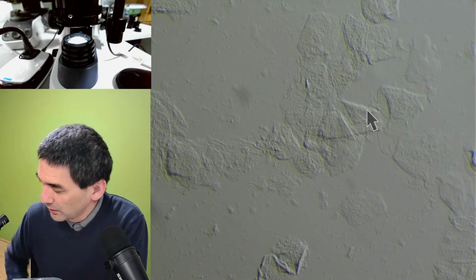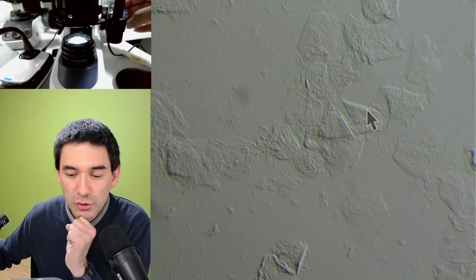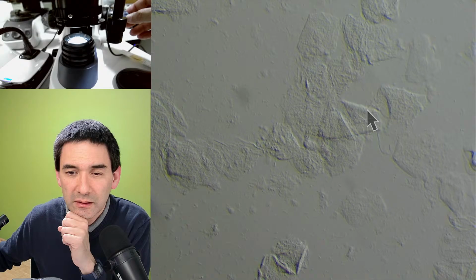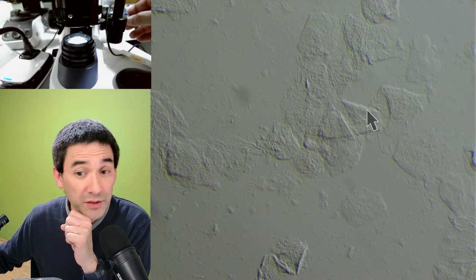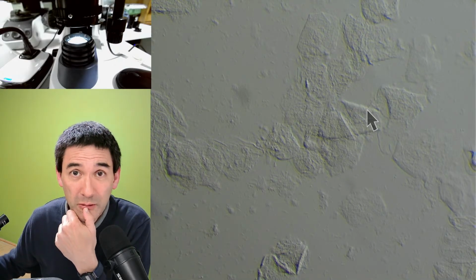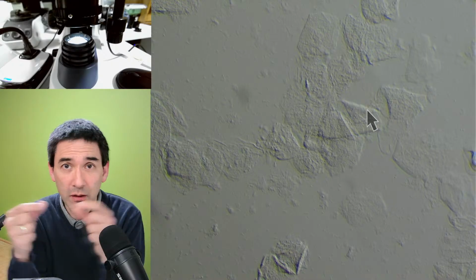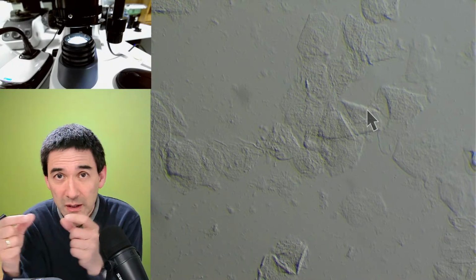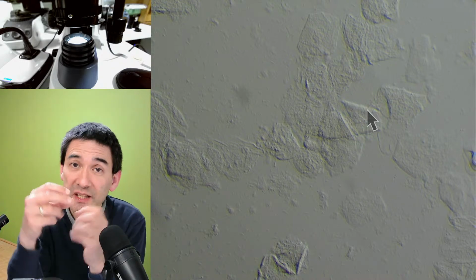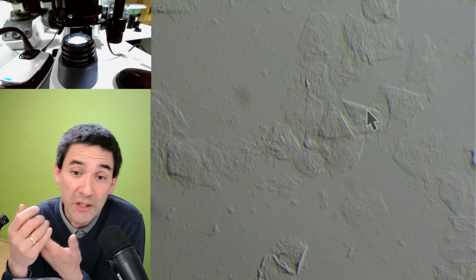Okay. So that is basically the cheek cells that I have. And a sliding filter, honestly, if you have a sliding filter, that should also work. I have also a microscope downstairs where you put a filter in and you can actually slide it horizontally. That also displaces it from the center, but it should work equally.